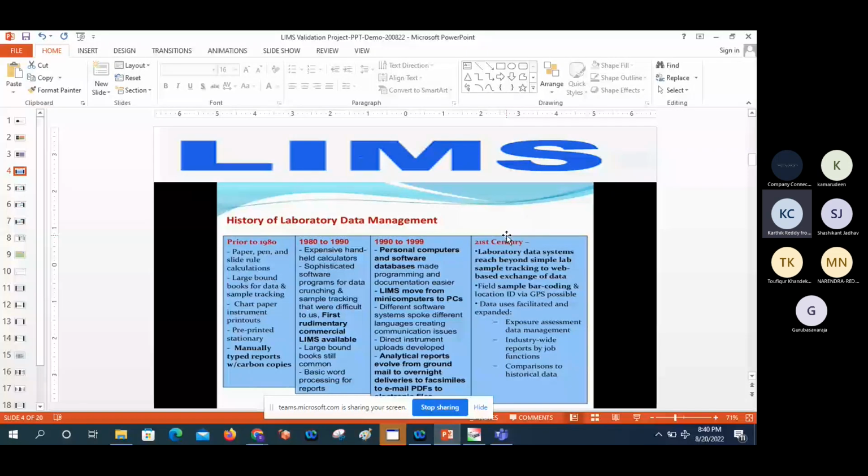The main thing is that master data plays a very important role, up to 70-80% once the LIMS implementation is done for any organization. After that, the support activities account for up to 30%. The remaining things can be covered as per the CSV life cycle, from the initiation phase to the retirement phase.